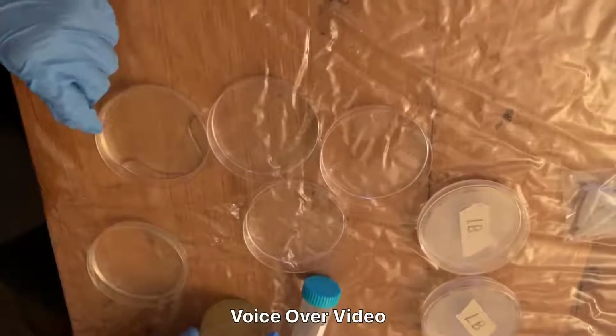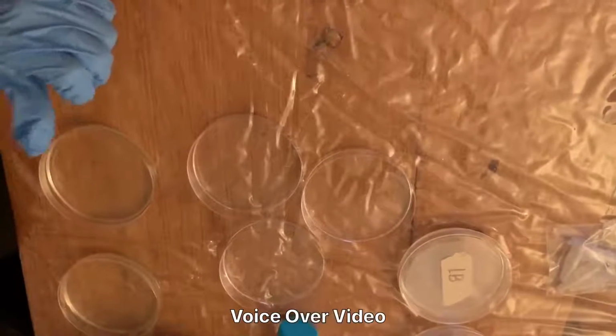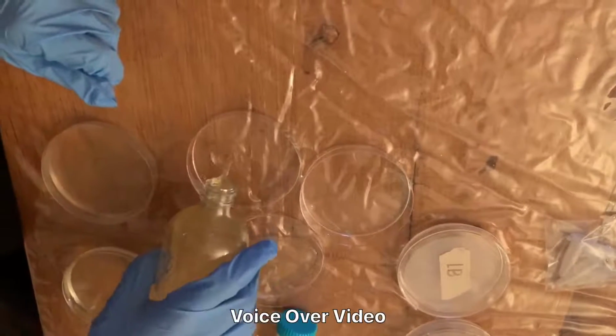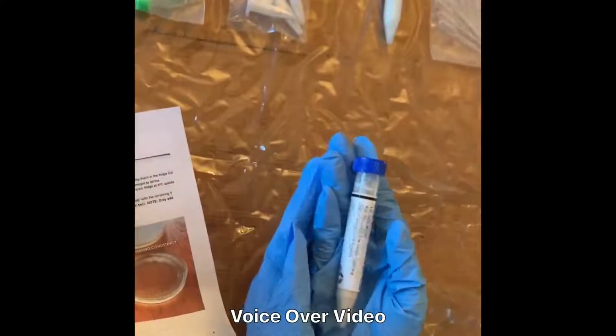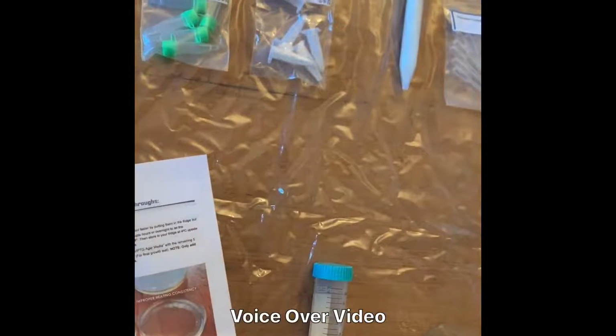And it's taking a bit just to even it out. I did have enough to fill all 5 plates, so it was pretty good. Only filled the bottom to cover it fully. And then I'll repeat this process with the LB agar and not the amp.